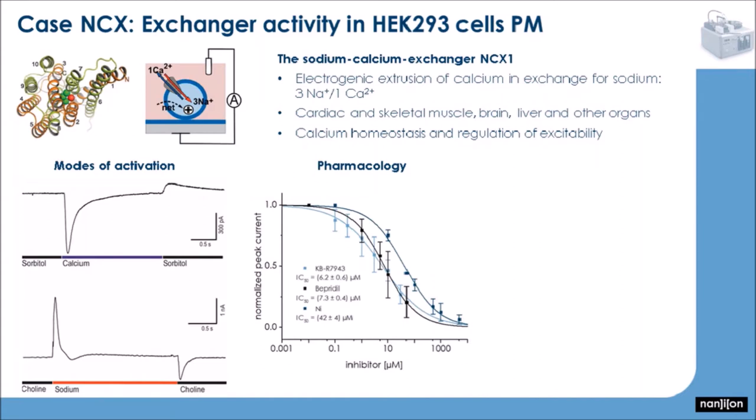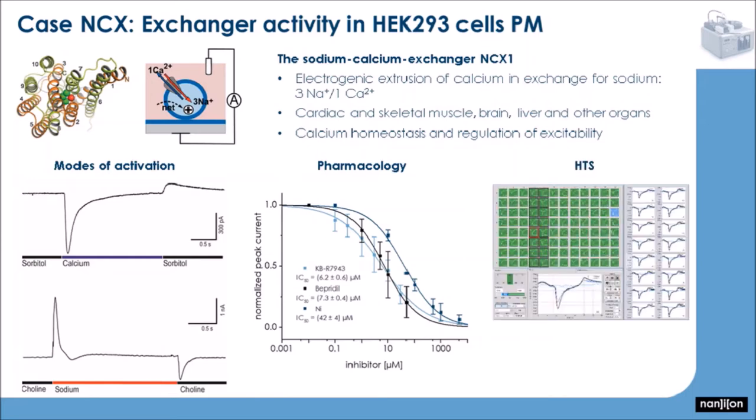We did some pharmacology to show this is really NCX current and there is no background. We get a 100% block with the compounds. And then we also transferred the whole assay to the HTS system, so it was also possible for screening compounds.